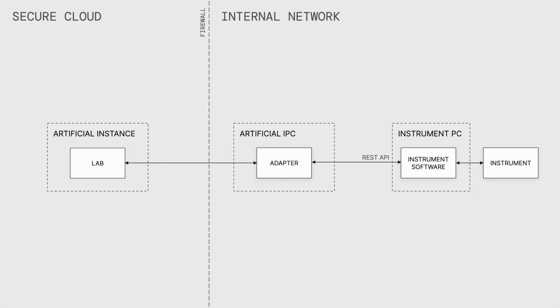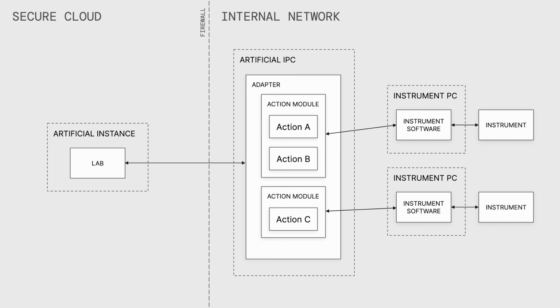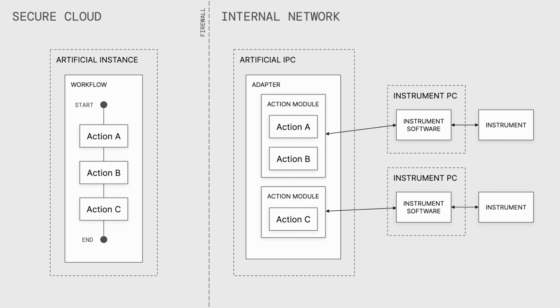Obviously, most labs don't have a single instrument. They have multiple instruments and other resources. Within the adapter, each of those resources are represented as action modules. Within each action module are a number of actions that represent the actions that could be taken on that resource. For example, a liquid handler might have an action called run protocol, whereas a LIMS might have an action called upload results. These actions are the building blocks used to build workflows.